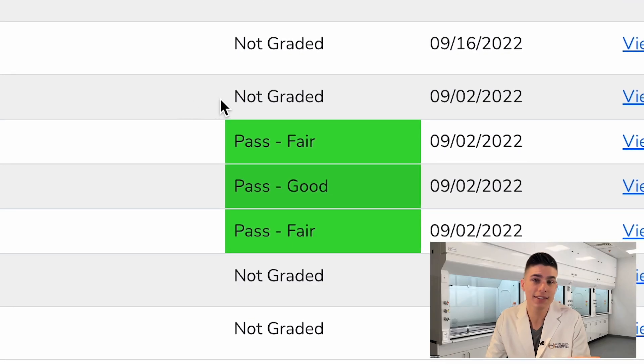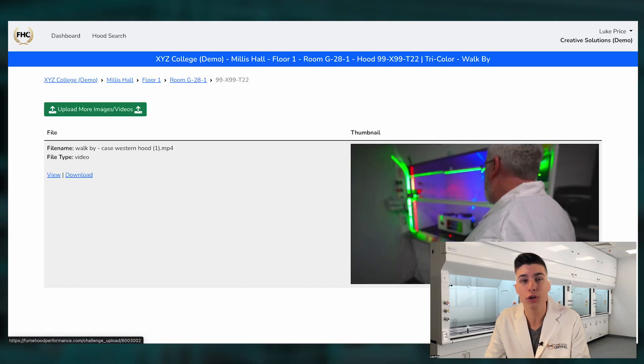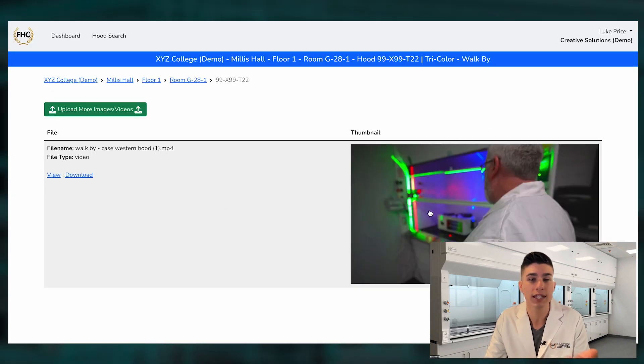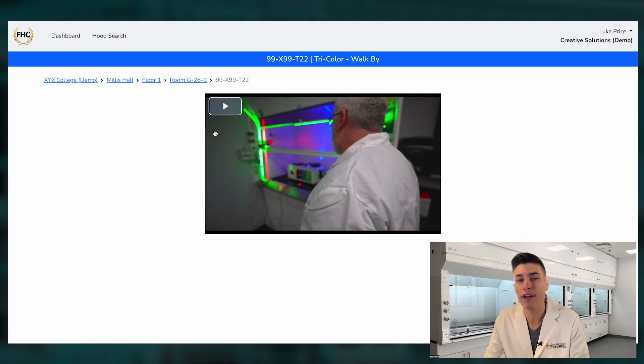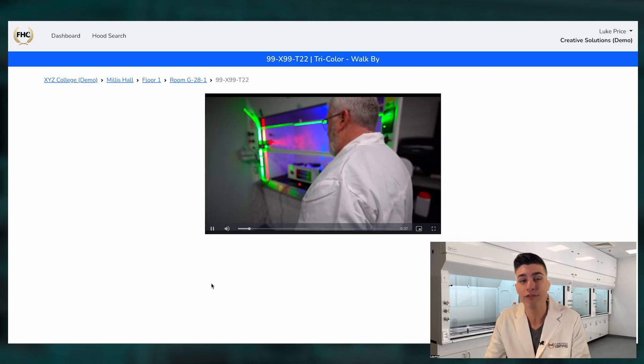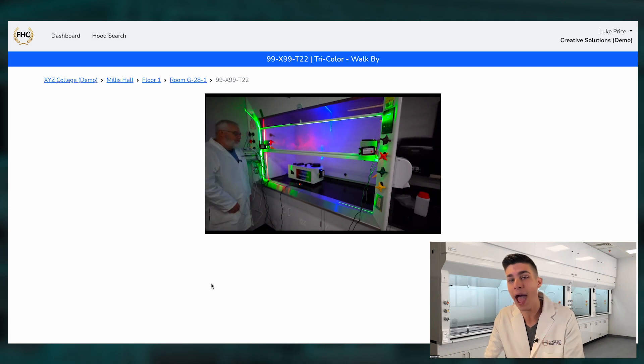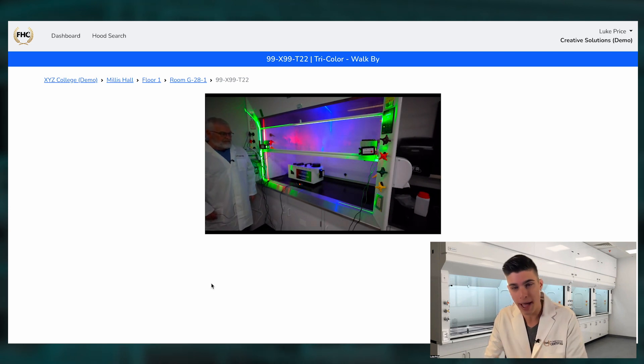I can see that this hood passed, and I can even see the video or photos of the hood while it was being tested. Never before have you been able to store that level of detail and information in such an easy-to-manage and easy-to-access format. This is exactly what we set out to do in building this software — to make things simple, and to bring fume hood testing into the modern world.